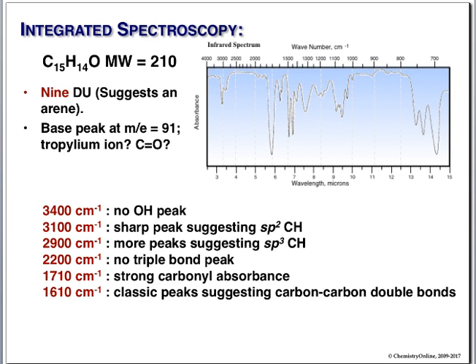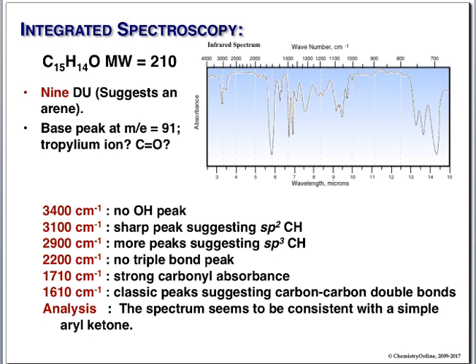So what does this look like? Benzene rings and a carbonyl. Not an aldehyde, is it? Because there are no aldehyde peaks right here. So writing this down gives you full credit for the IR. That's the simplest way, very systematic.